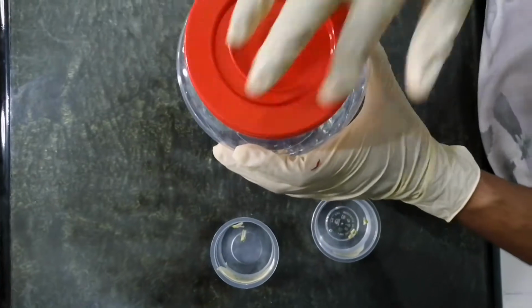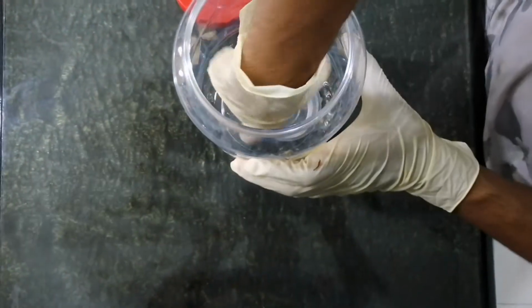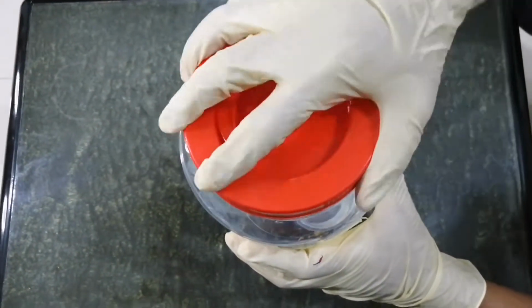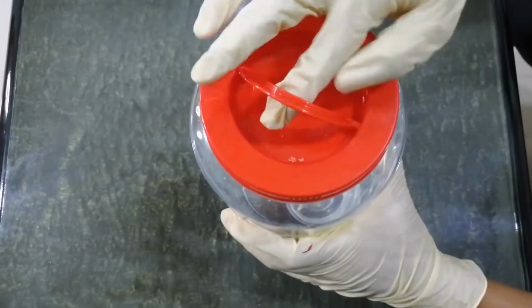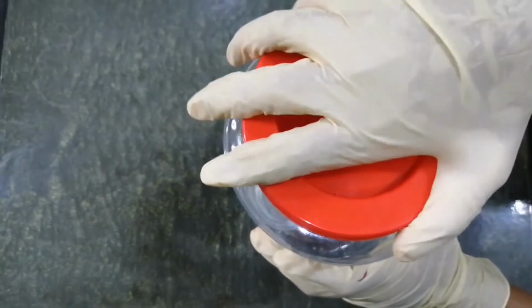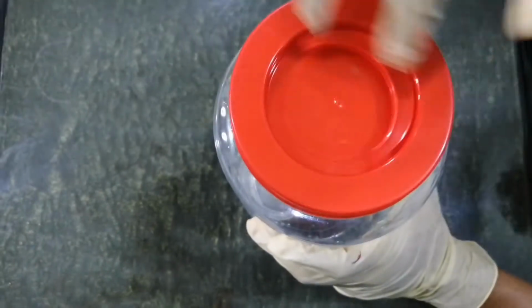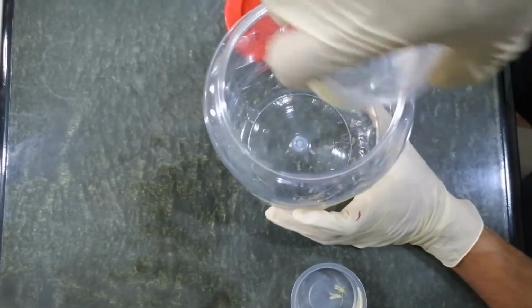After that, put the bottles containing the specimen inside the vacuum chamber and then properly close the chamber lid and switch on the vacuum chamber to apply for 15 minutes. Double check with the lid. After 15 minutes, slowly release the air and open the chamber lid. Then take out the specimen bottle.